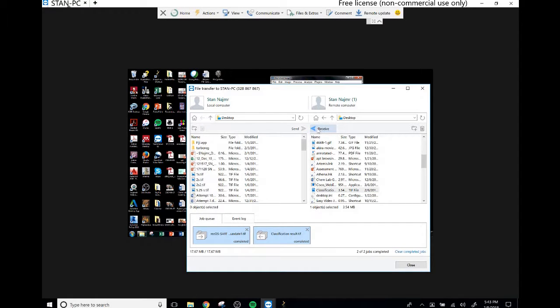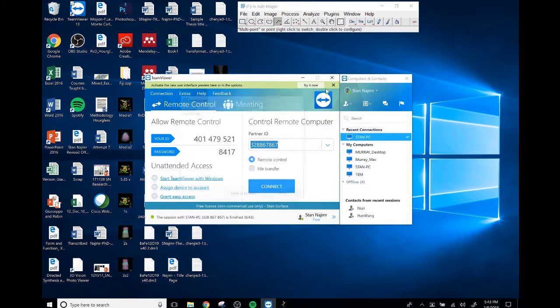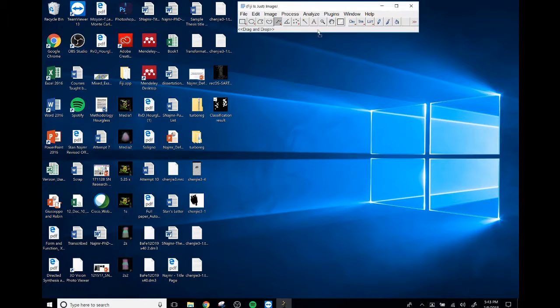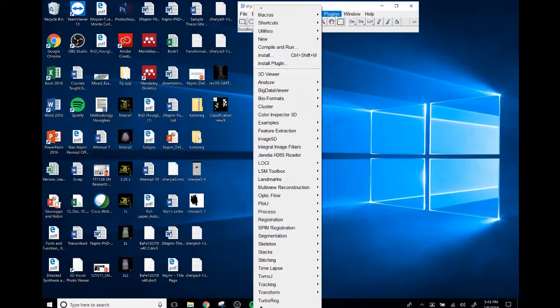That easy, huh? Okay, so we can just log off of that and load this up here. Voila. Okay, so now what we're seeing is a top-down ortho slice image of that.